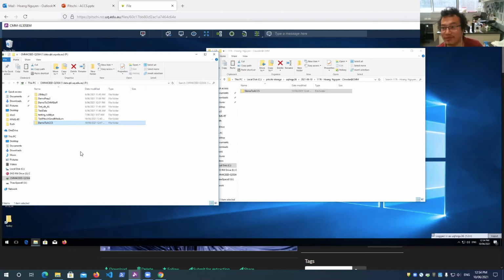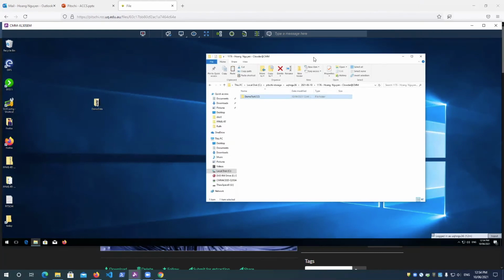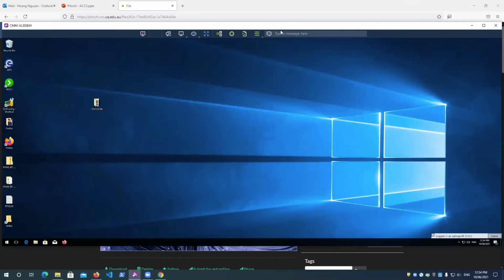So is there any question before I log off, and then we see the emails? There's a question in the chat from Hoang. Let me see. Sorry, I don't see the chat. Hoang has asked, I'll read it to you. It says, the NFS drive of MeDiCI is not exported to instrument computers, but is to the Clowder PC only, yeah? NFS drive of MeDiCI.